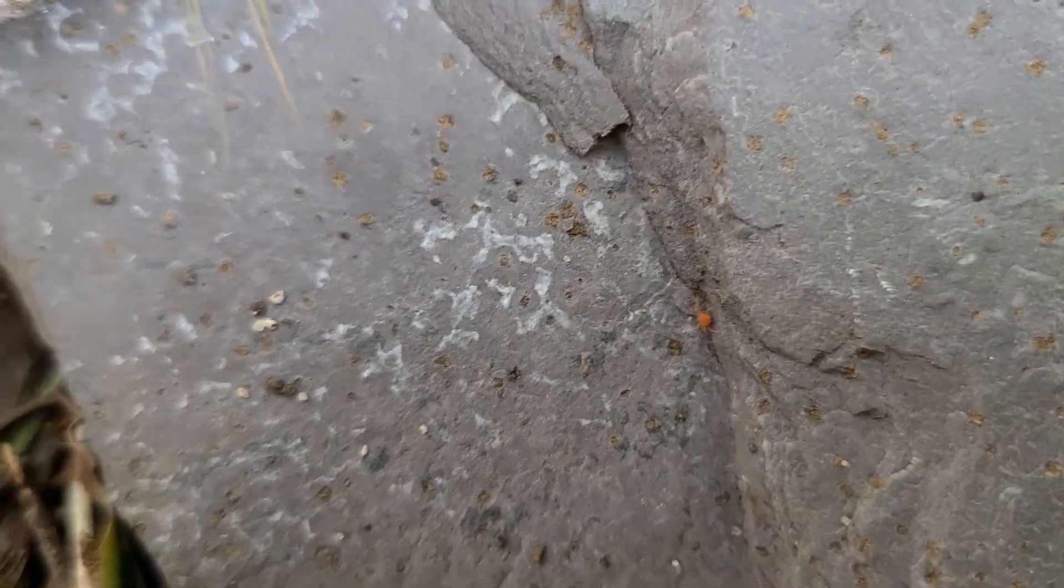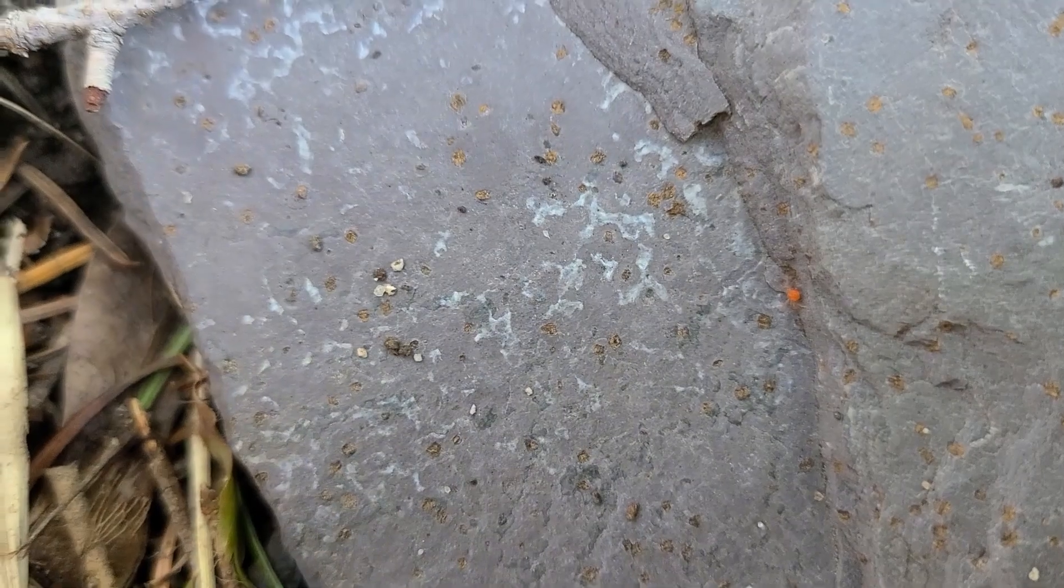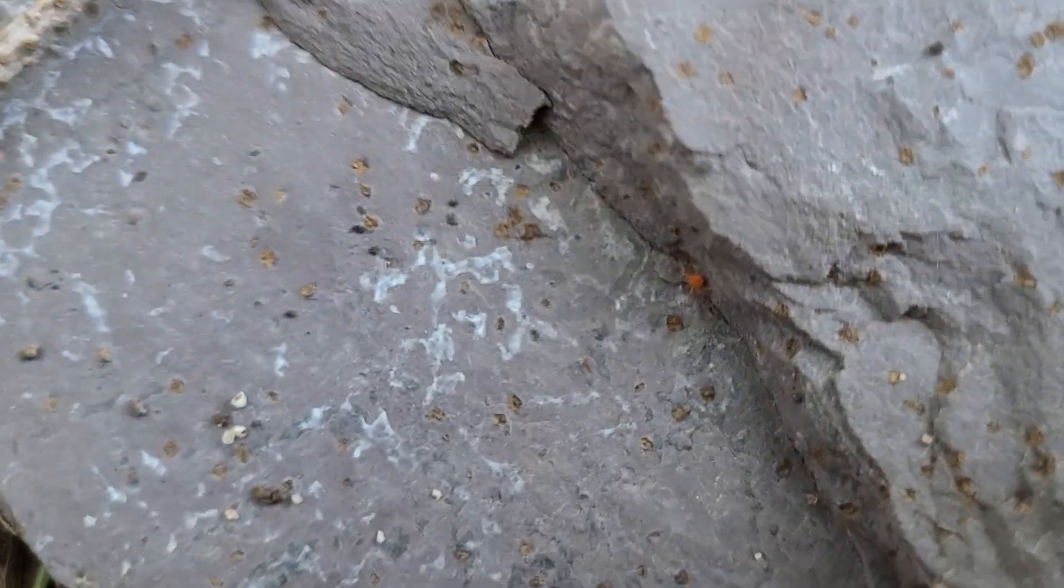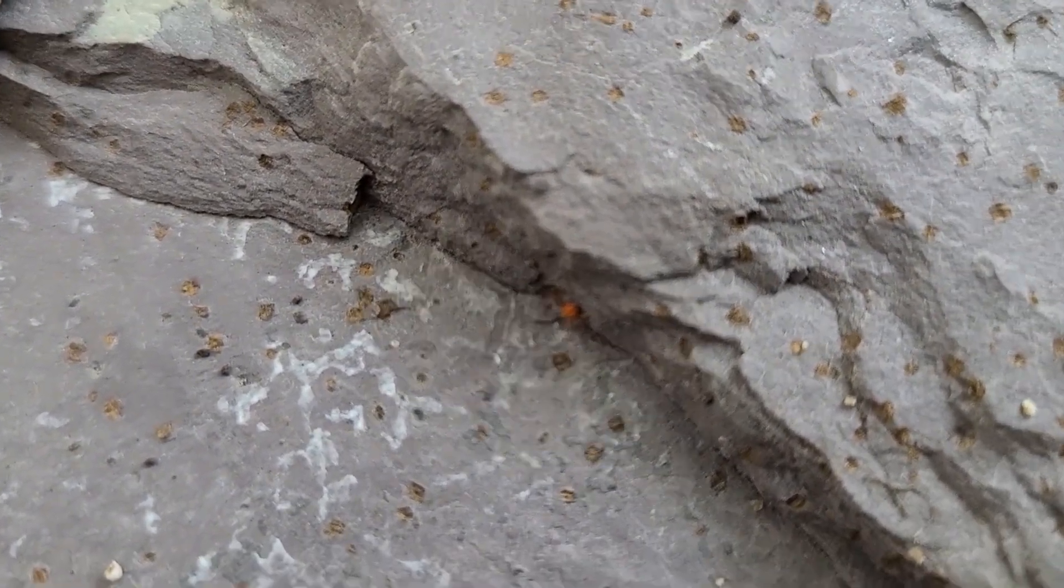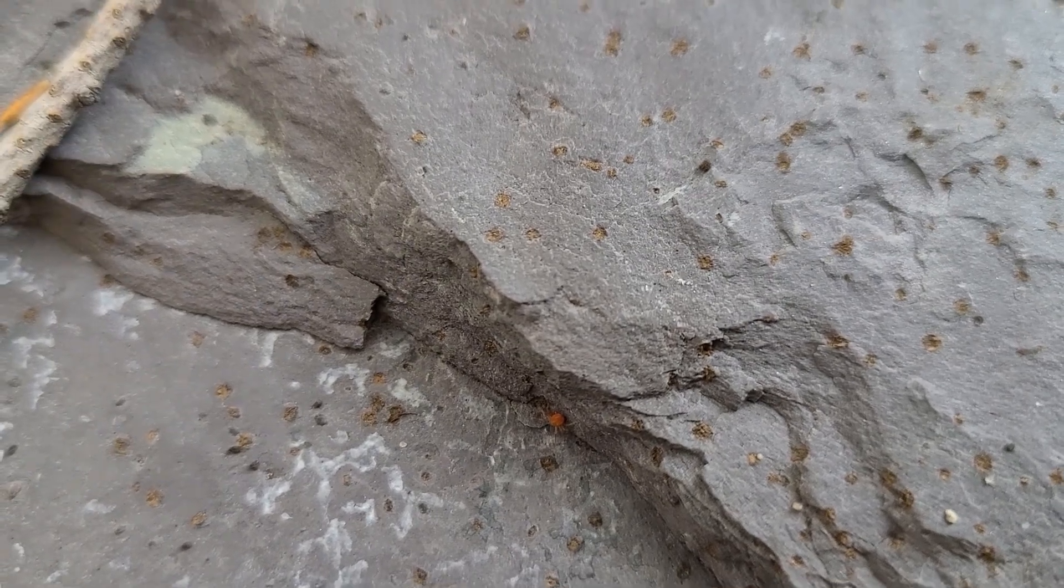Now, have you ever been outside and you've seen these little red bugs running around? These are mites. And today we're going to gather up a few of these things because they're everywhere and we're gonna take a look at what they look like.